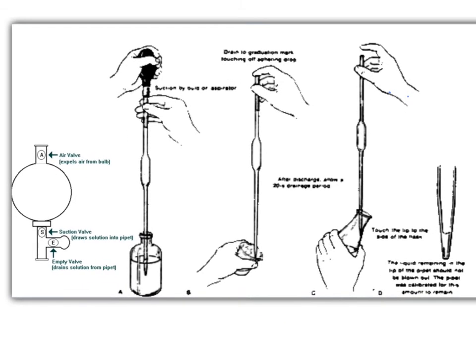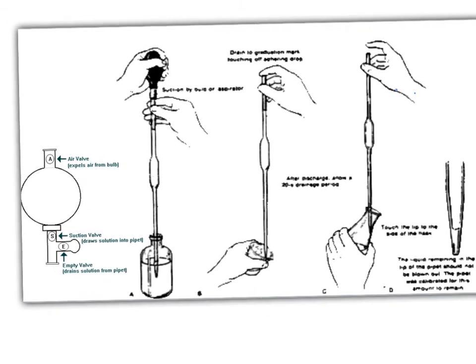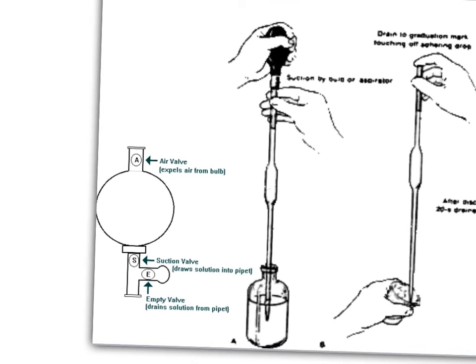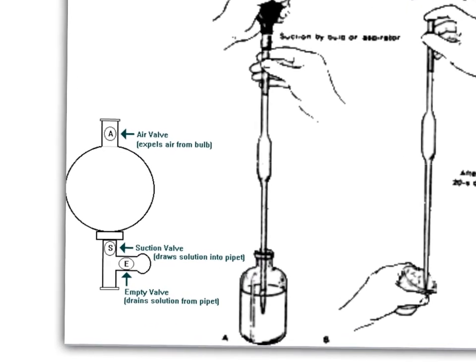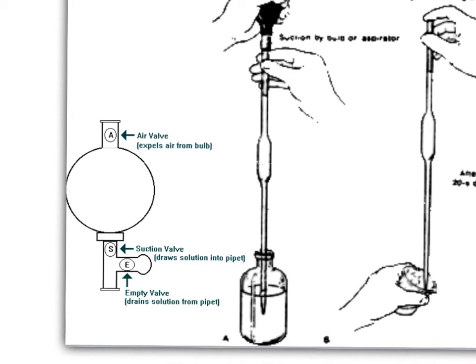So this bit of equipment that the hand is holding is called a pipette. It's called a volumetric pipette and it accurately measures something like 20 mL far better than something like a measuring cylinder. Now the 20 mL will be written on the side of the pipette and there will be a line where the 20 mL is up to.